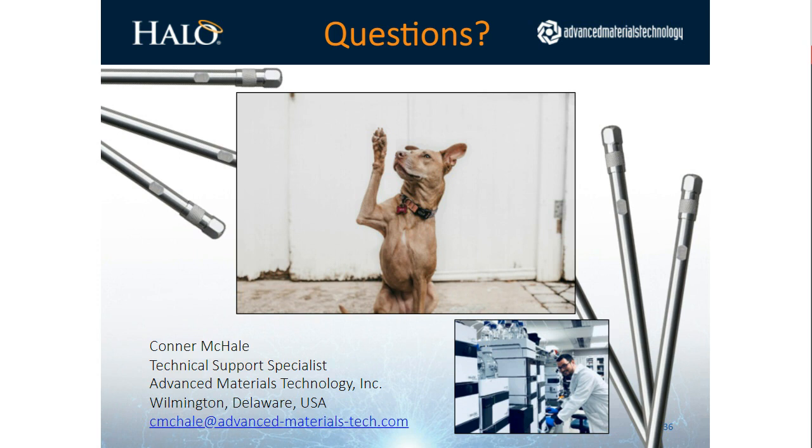I would actually put the column in the reverse direction and try to flow different organic solvents through, acetonitrile, methanol, flow through the column in the reverse direction to try to unplug that inlet frit. That's what I would try first. I don't think sonication will help. Great, thanks for that recommendation.